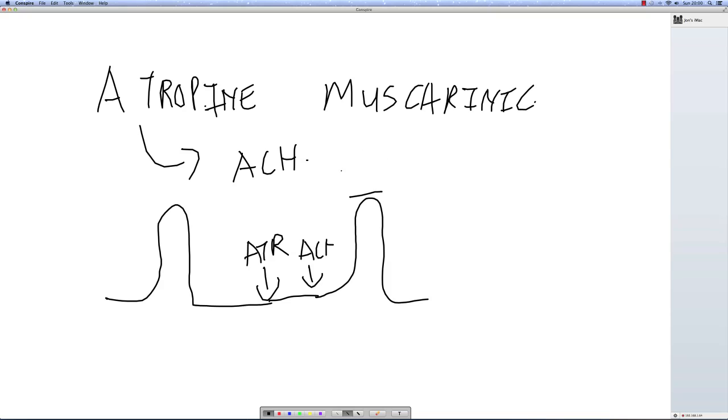So you need to go back around and repeat the experiment again, but this time increasing the atropine concentration to 1 times 10 to the minus 7 molar. If, on the other hand, your response is 50% or less, then you will have determined that you have had an effect of atropine, and that is what we're looking for.